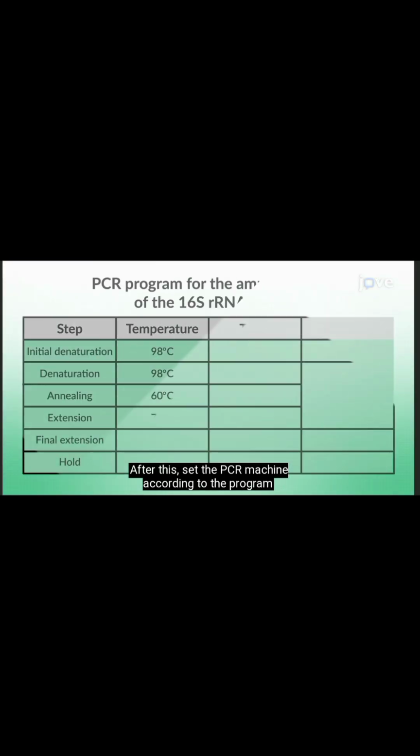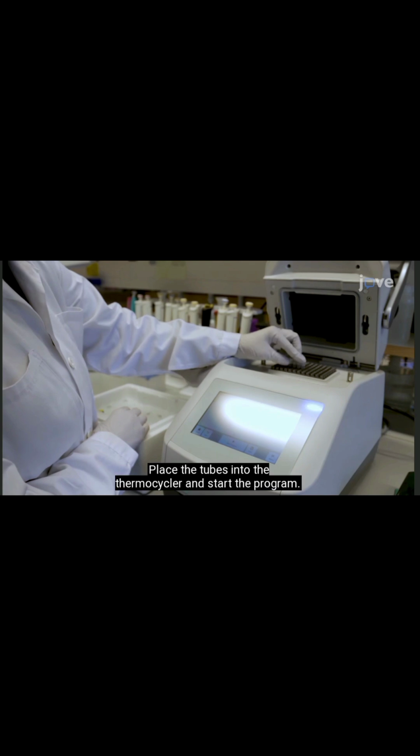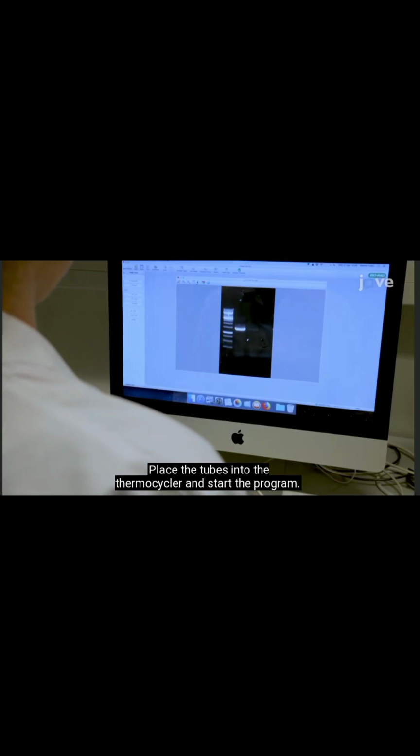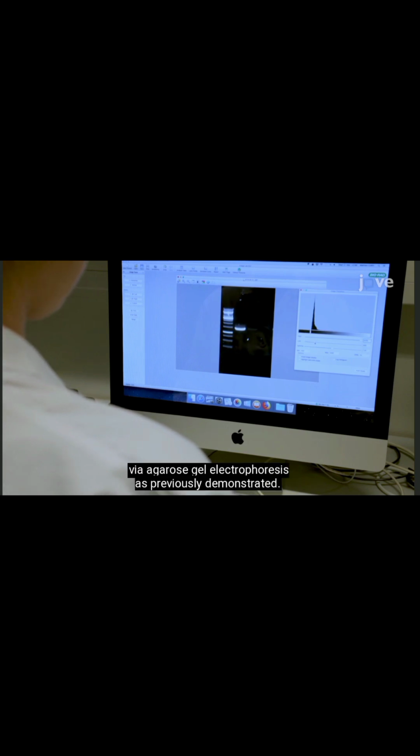After this, set the PCR machine according to the program described in the table. Place the tubes into the thermocycler and start the program. Once the program is complete, examine the quality of your product via agarose gel electrophoresis as previously demonstrated.